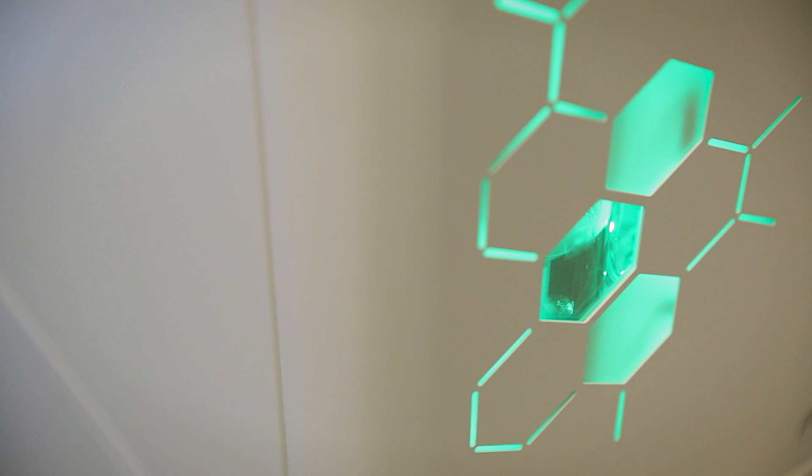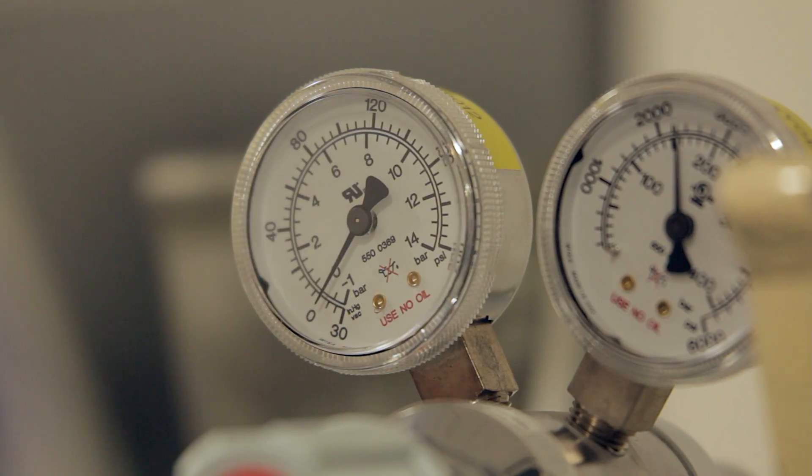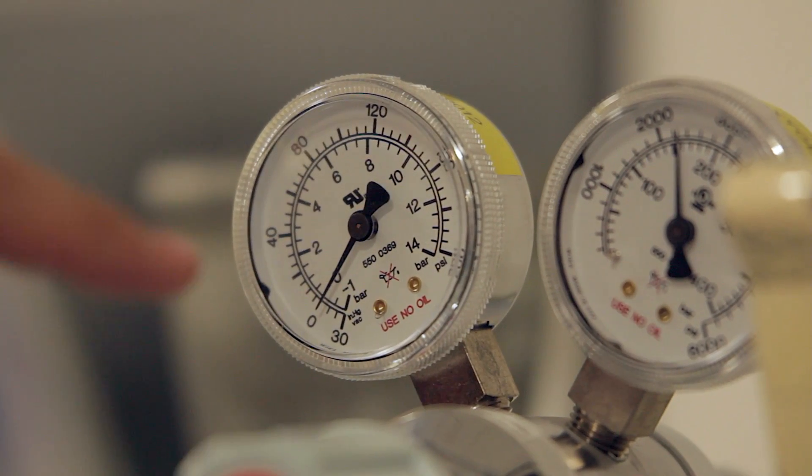A typical large 50 liquid litre cylinder probably weighs somewhere in the region of 50-60 kilos. Having a gas generator eliminates the need to keep swapping in and out these cylinders, eliminates the health and safety risk of moving them around and also eliminates the need to monitor them and to worry about the risk of running out of gas.